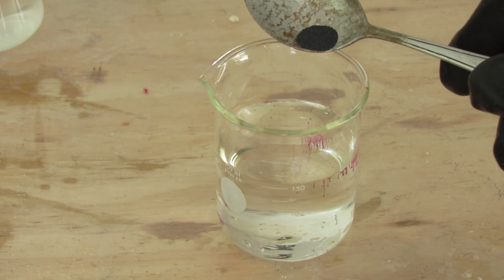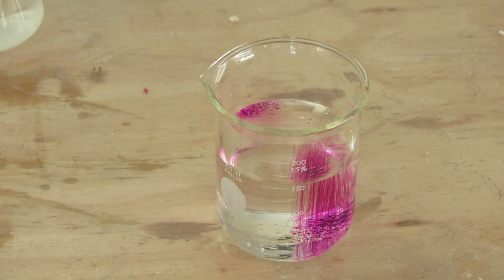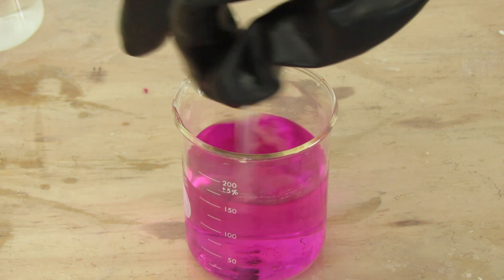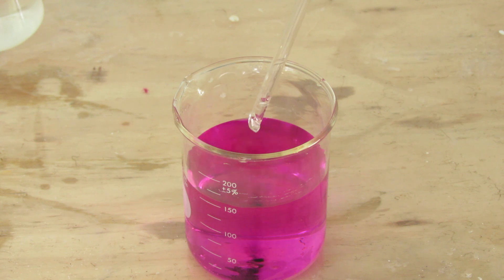In a separate beaker with 150 milliliters of water, dissolve a small amount of potassium permanganate, just enough to lightly color the water pink, into it. You've got to make sure that the water is still see-through or else this won't work.